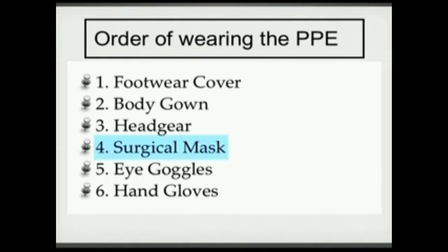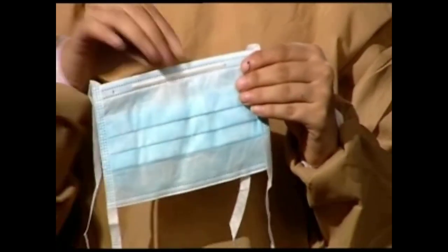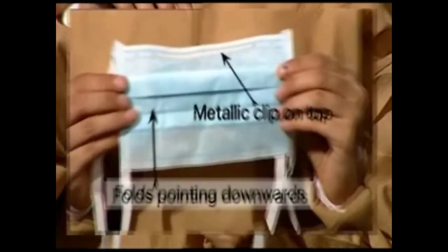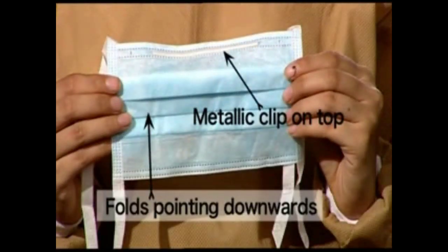The three-layered surgical mask needs to be opened before putting on. Ensure that the folds are pointed downwards and the inserted metallic clip is on top.